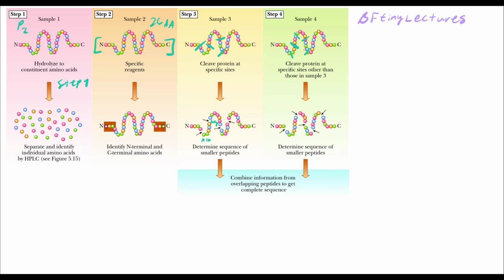And essentially, you get more data, and between step 2 and 3, between step 3 and 4, you're going to get all these data points saying, well, this was cut, this was not cut, and then piece them back together like a puzzle. Personally, it's not my style. I would not like to do that, but some people like that.